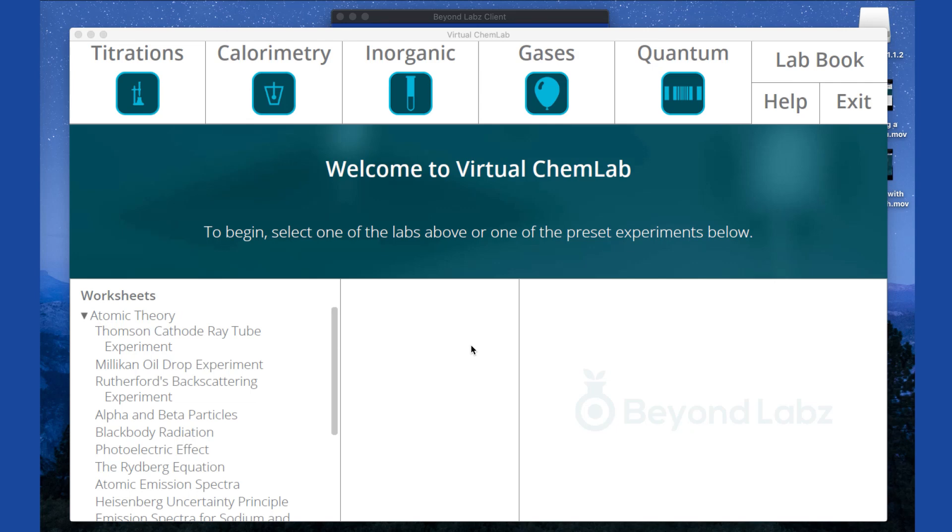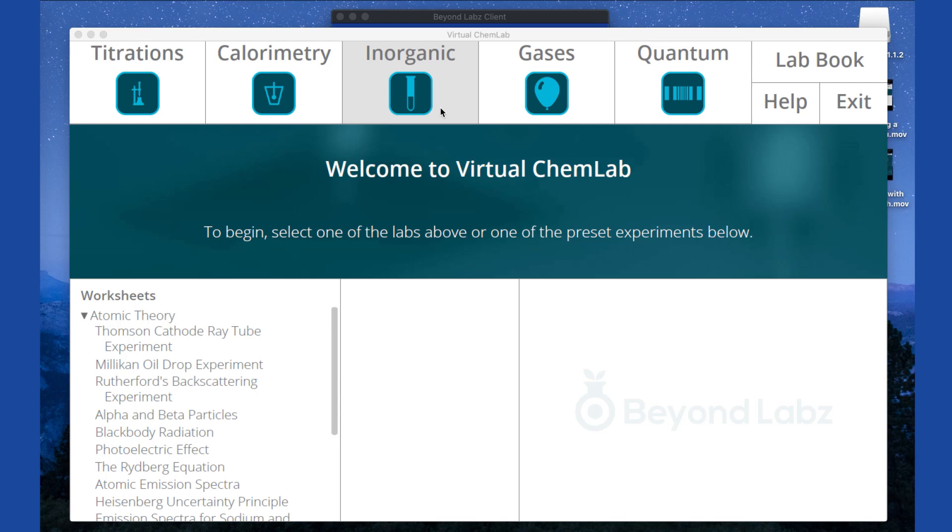The first thing that you'll notice when you open one of the lab modules are these links on the top row. These links will take you to the corresponding lab benches, and these lab benches will have absolutely nothing set up for an experiment. All the tools will be available for use and all the stockroom reagents will be available, but nothing will be set up for a specific given experiment.